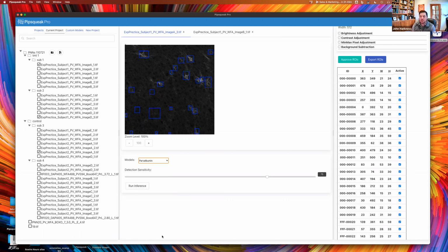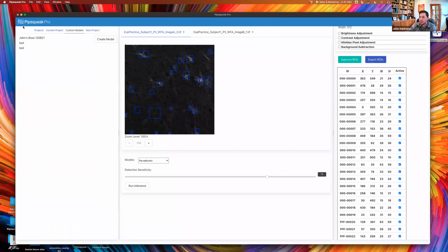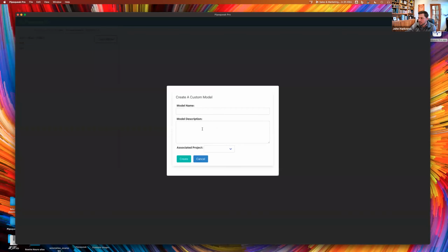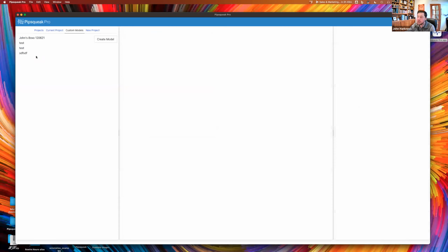But currently your models are specific for you, and they're only changing, and this is a very important point, they're only changing when we click train model. Let me go back here, since we didn't really see a great example of this. So here's just another model name. We're going to take one of the projects that I started today and create that.